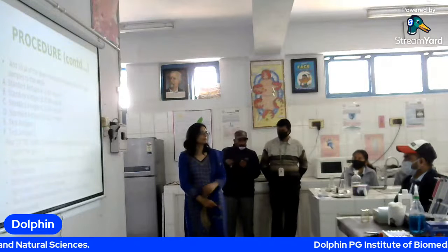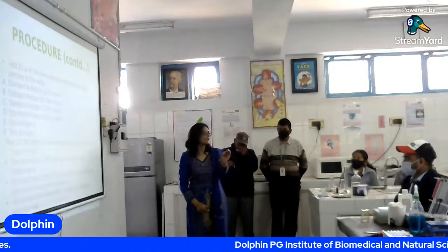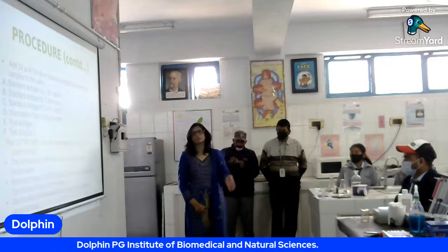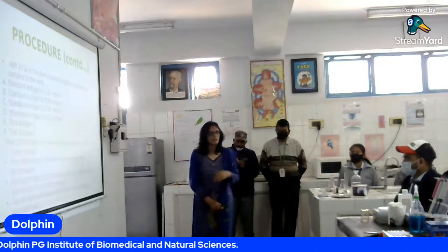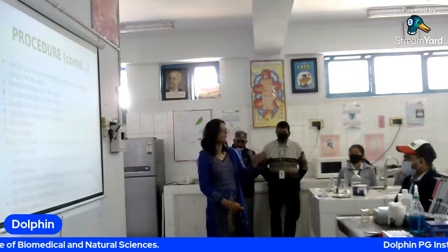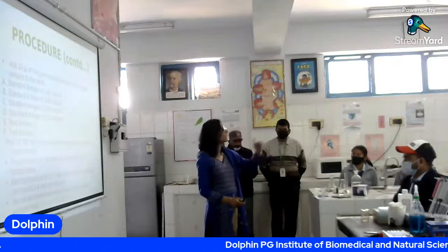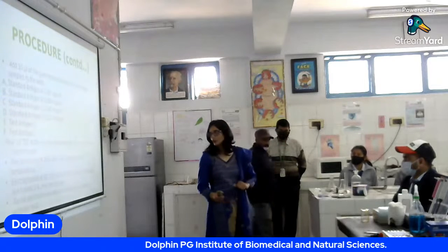3 to 4 centimeter. The dye, you can see it moving. Once it has moved 3-4 centimeter, you can stop it. Or you can give additional 10 minutes for better resolution also. Our electrophoresis can be completed within 1 hour. So we will see that in 1 hour the dye will go quite far, and there we will switch it off.